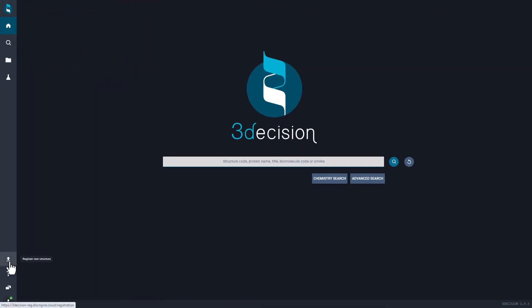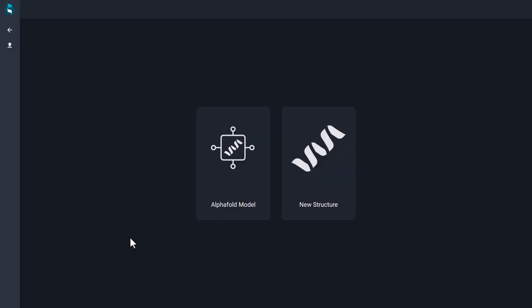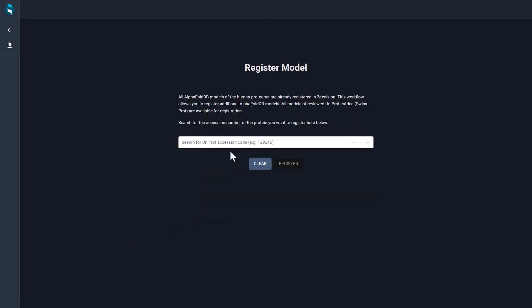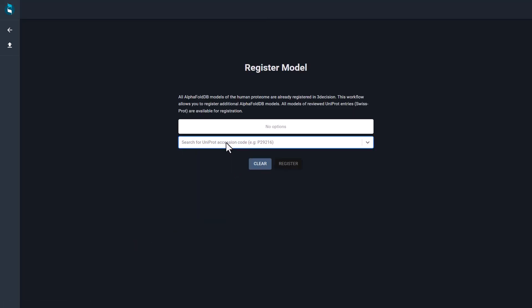The 3Decision database includes the AlphaFold models of the human proteome. If you want to add models from other species, you can use the dedicated registration page.